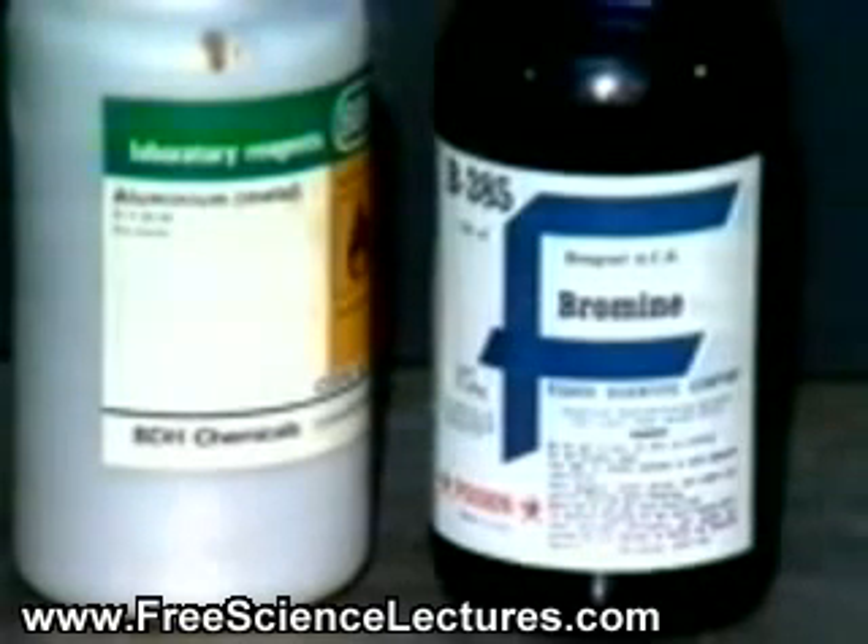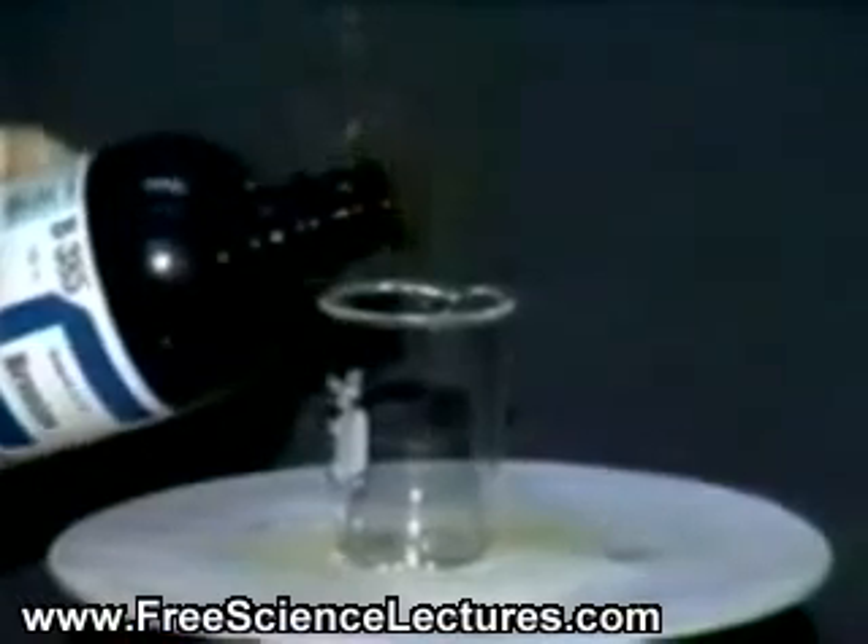In this experiment, we are going to react liquid bromine with aluminum to make aluminum bromide.